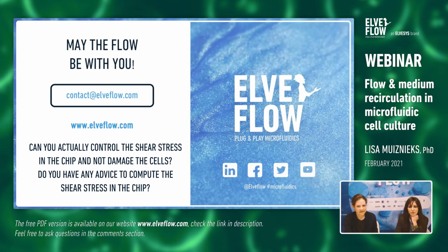Any more questions? A question from Zore: Thank you for the presentation. Can we inject air containing particles using the MUX recirculating system? Is it possible to trace particle motion within the chip?